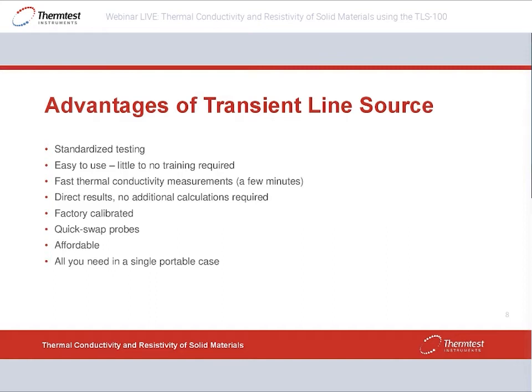So something about the advantages of the method. Well, first of all, the method is standardized. As mentioned, there are now 2 standards that apply, which is very nice, so you can select the one that's most applicable to your area of testing. It's very easy to use. Normally there is no or very little training required to start using it. If you follow the manual, you will be able to test without any big errors.